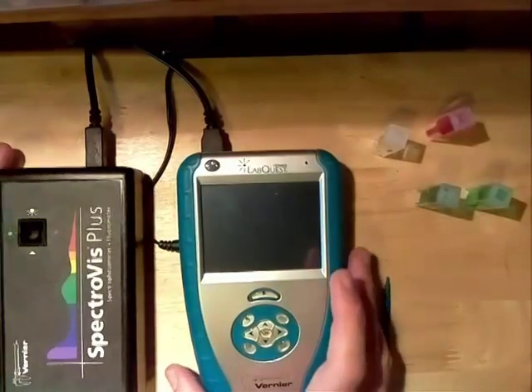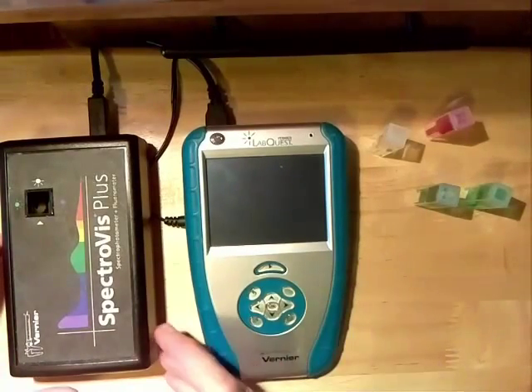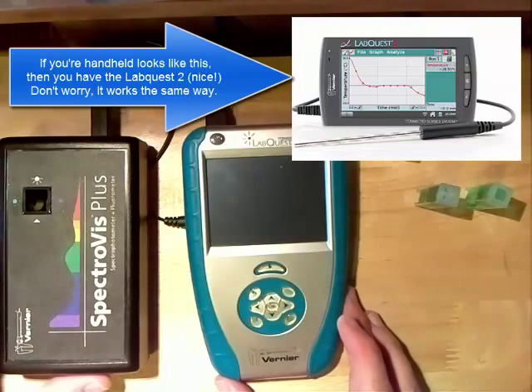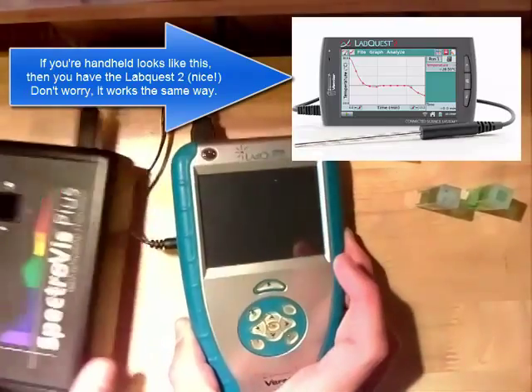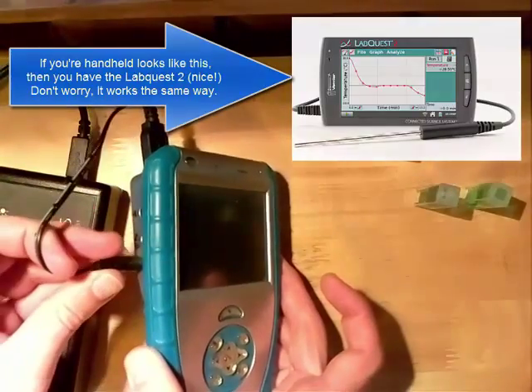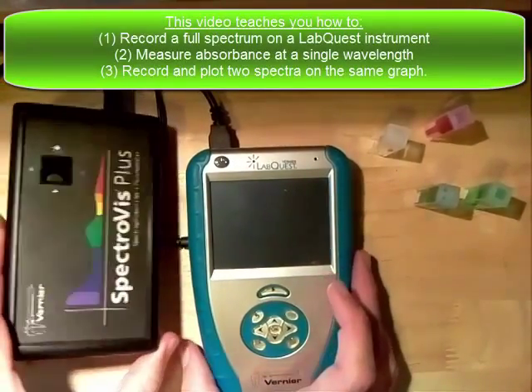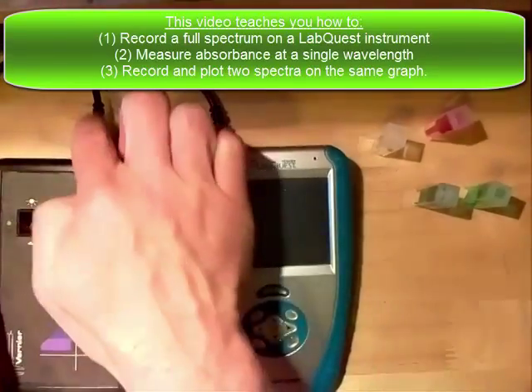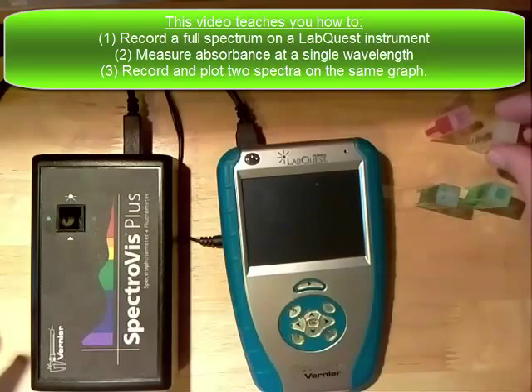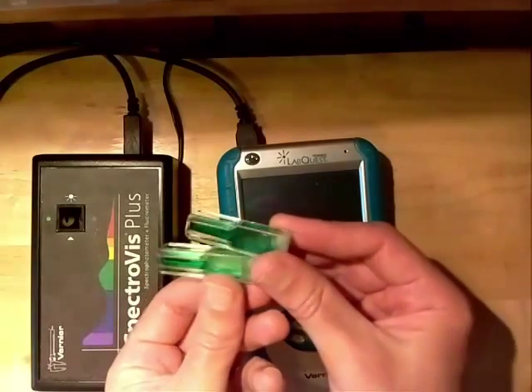Here we are with the LabQuest Vernier handheld computer along with a SpectroVis Plus spectrophotometer. This is a brief tutorial on how to use this instrument. We're set up with power connected to the LabQuest and a USB cable out to the SpectroVis — this particular SpectroVis gets powered through the USB so it doesn't need a separate power supply. I've got a few cuvettes, some water, some red dye, and two different concentrations of green dye.